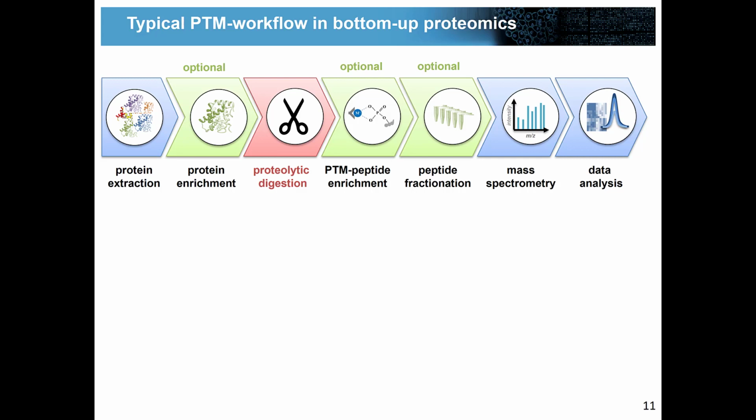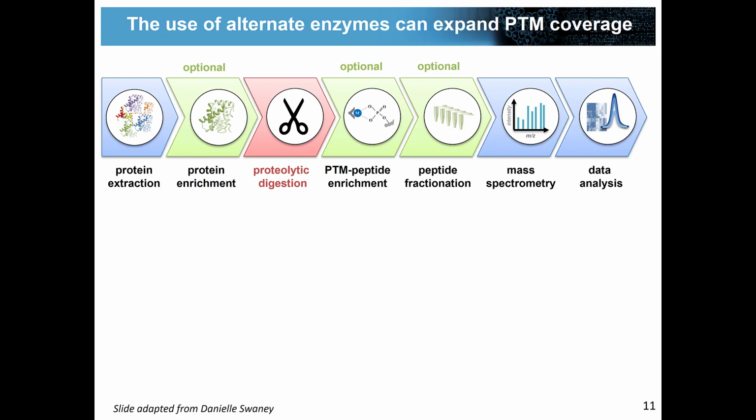From the perspective of PTM analysis, this digestion step is also especially important or interesting, because when it comes to PTM analysis, the one important thing you need to keep in mind is that you really will have to work on peptide level, or in other words, you don't have the freedom to combine or choose different peptides of a protein, and to combine information from various peptides to one protein information. No, in PTM analysis, you're really bound to peptide level.